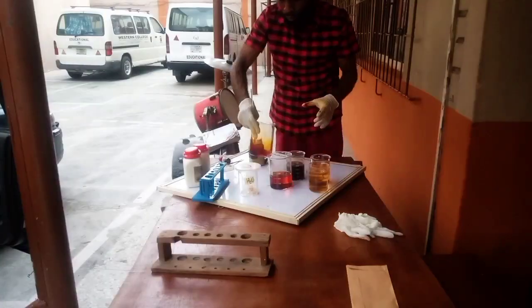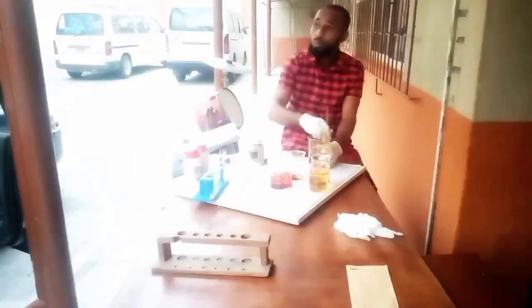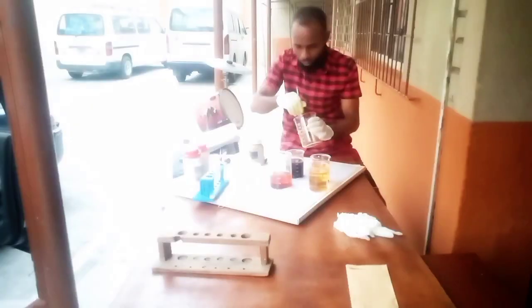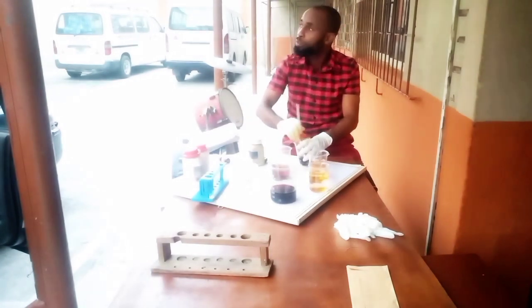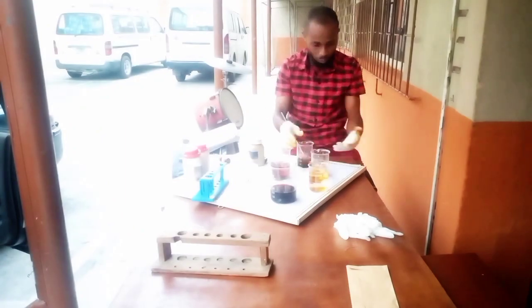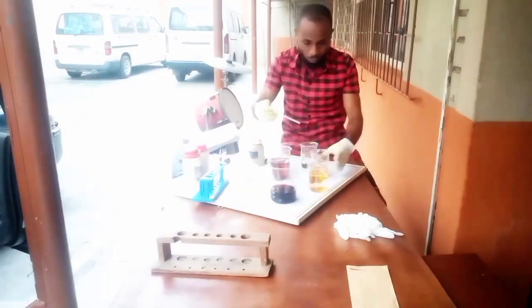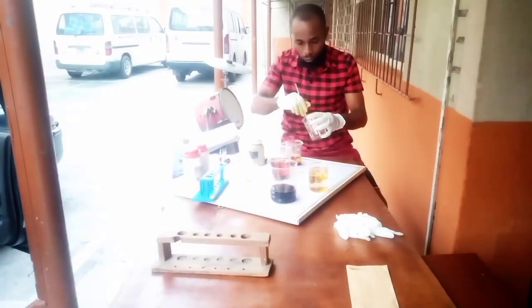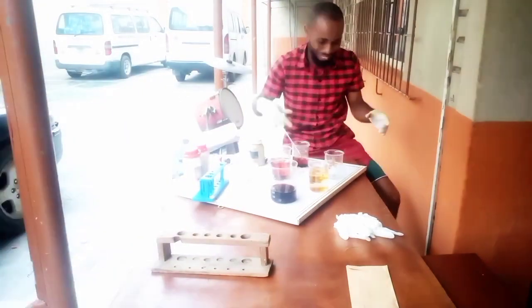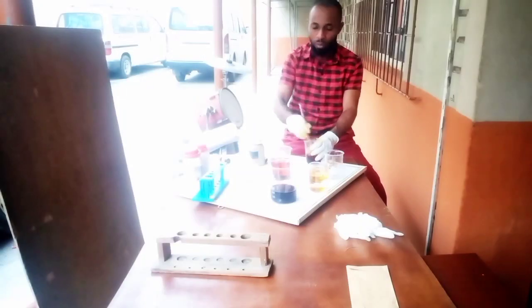Just know that what I'm doing here is just to grind this. I first of all dissolve most of them with water before I move over to use my potassium iodide. The potassium iodide you are seeing here, there was actually some problem. Rain was falling, therefore I needed to move from one place to another in order to prepare this properly. I started adding my potassium iodide gradually, small by small.